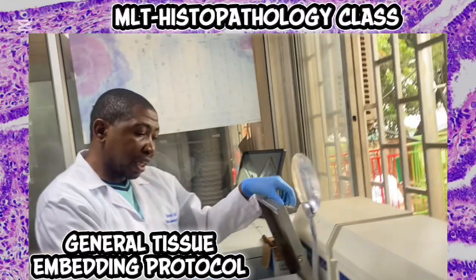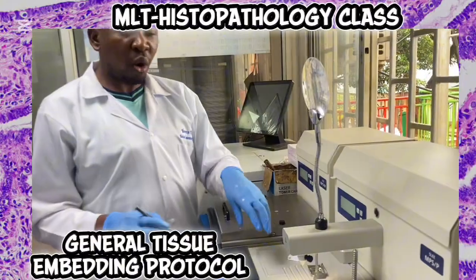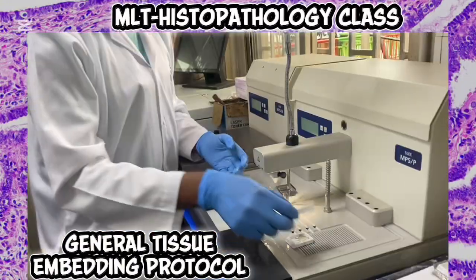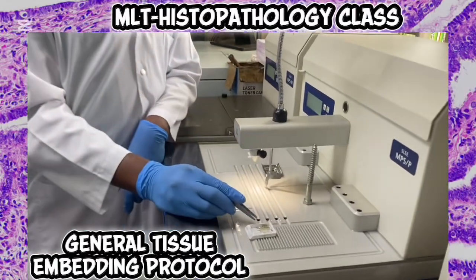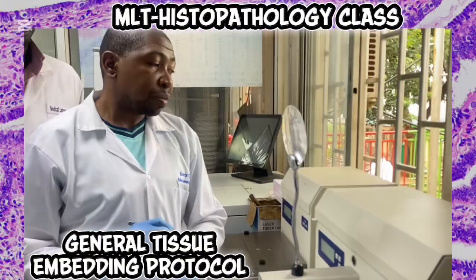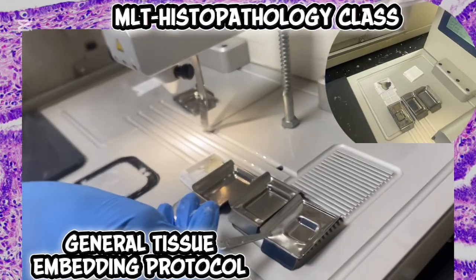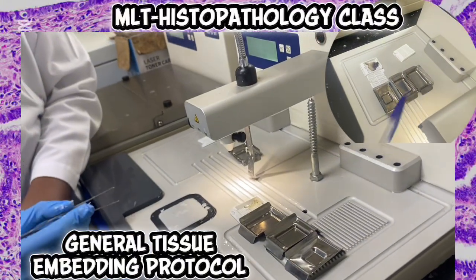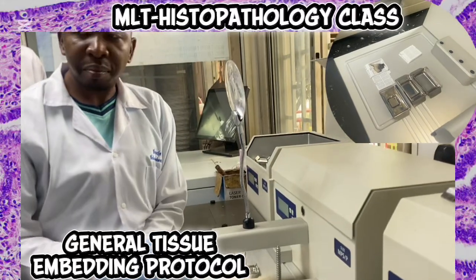Number one, we are going to pick up our sample from the tissue cassette compartment. Place it on your warm surface. Okay. Then we open. So you look at the size of the sample. The size of the sample will tell the size of the mold to be used, because we have different sizes of molds. You have a small one, followed by this, then followed by this one. So you look at the size of the tissue, then you compare which size of the mold you should use.